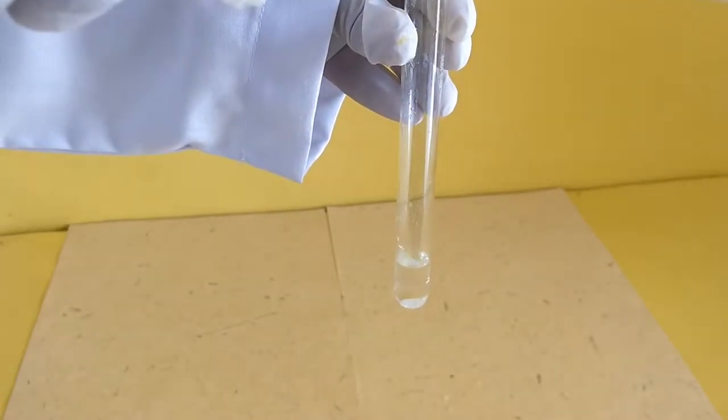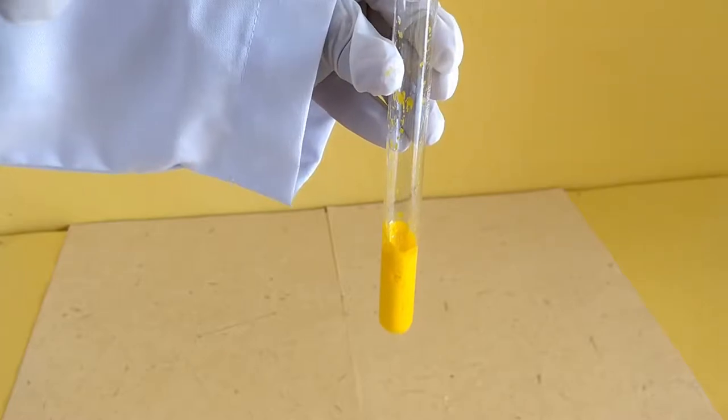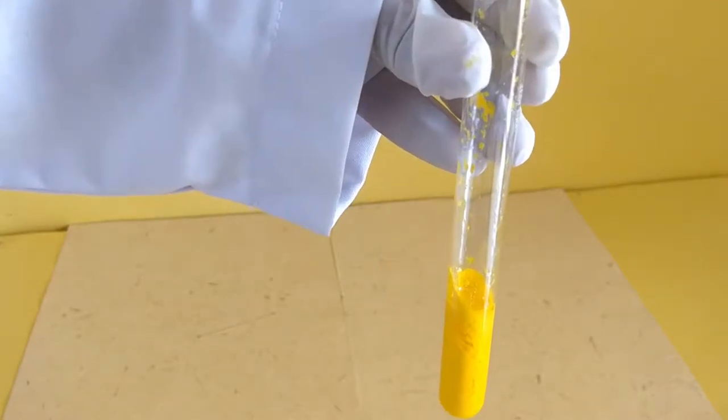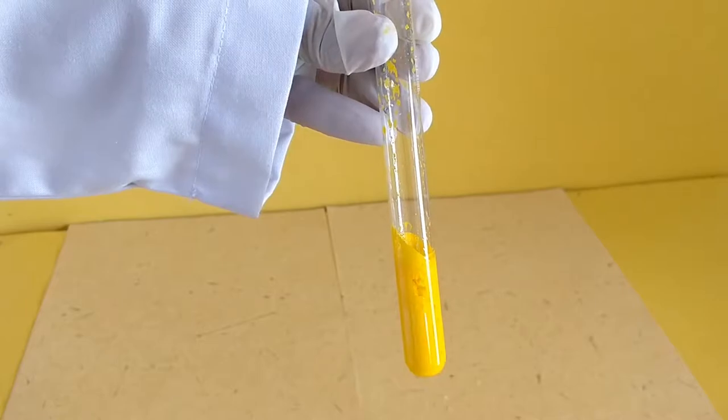You will observe a yellow-coloured precipitate is immediately formed in the test tube. This is lead iodide.